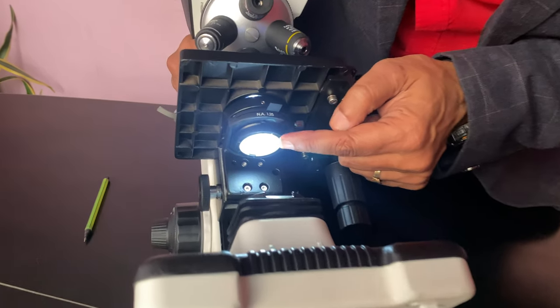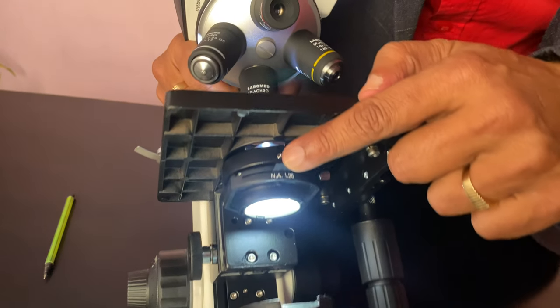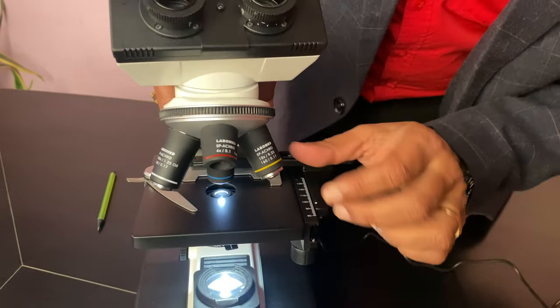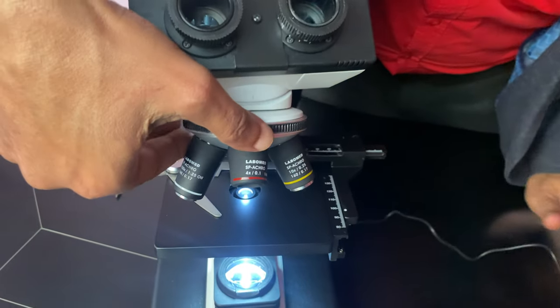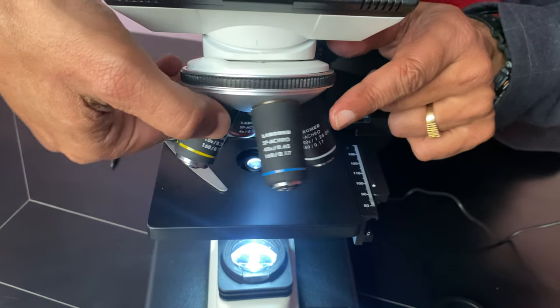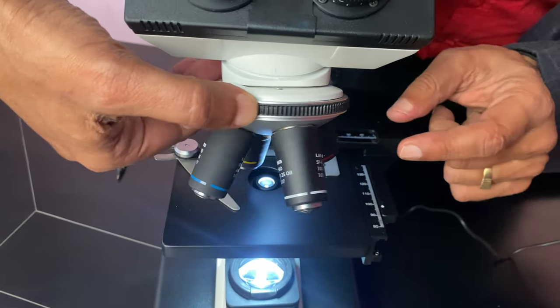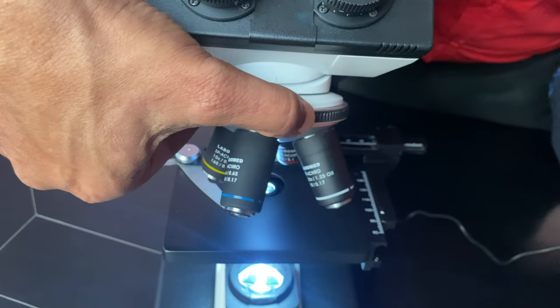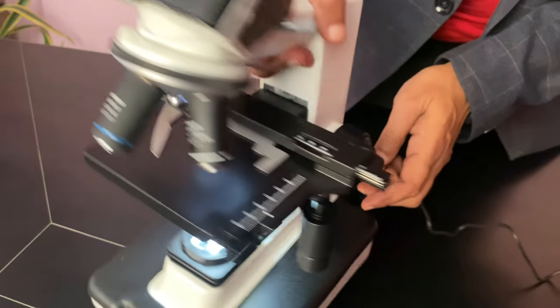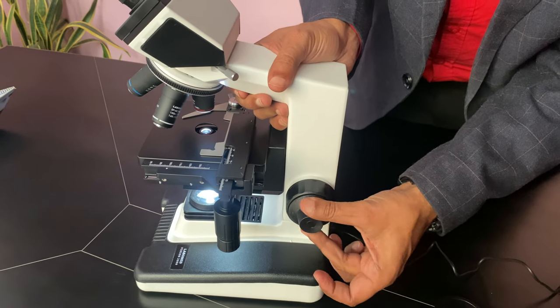Below, the condenser has a filter. An Abbe iris diaphragm is there — it will reduce or increase the light. The optics include four objectives: 4x, 10x, 40x, and 100x. It has a rubberized revolving nosepiece with ball bearings, very smooth. The focusing is by coarse and fine focusing, coaxial.